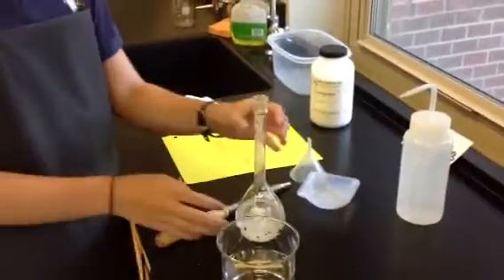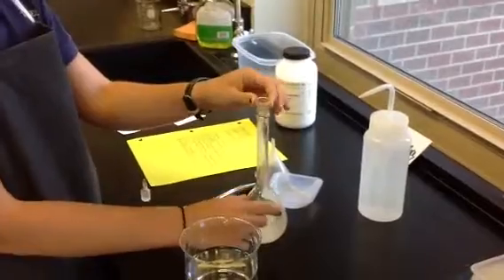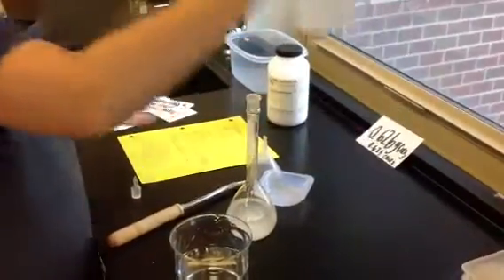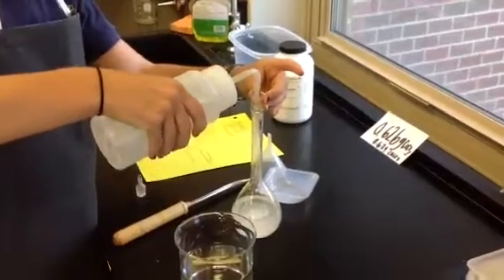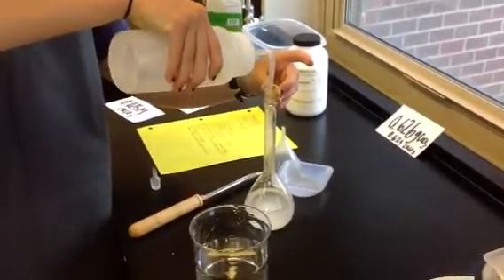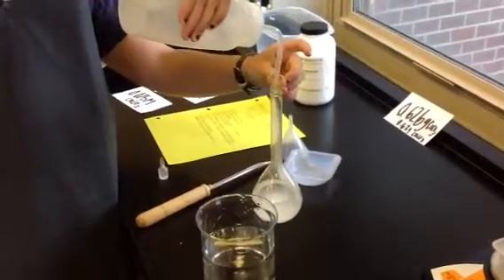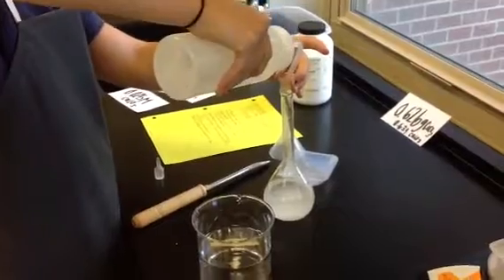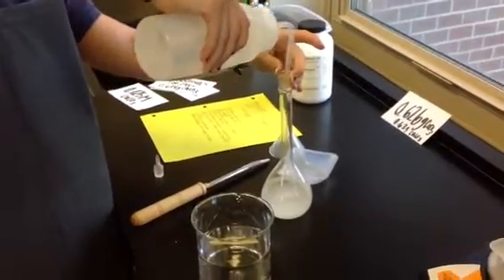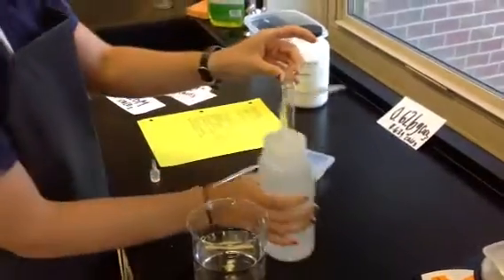You can see that some of the solute got stuck on the neck of the volumetric flask, so this is where my squirt bottle comes in. I'm going to use it to get the rest of the solute off the side — this reduces the error. Alright, so all of it is now off the side.